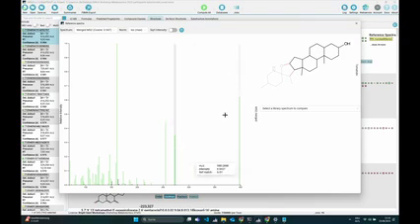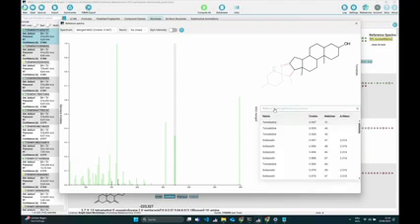But what I really wanted to show you here is that you can now select the library hit. If it worked for you and you could import the spectral library, the MassBank spectral library, you will now see a list of reference hits, and you will see the name of the compound from the spectrum in the first column, then the cosine score, the number of matching peaks, and also some delta mass, which I will show some example of very soon. Yeah, I still have enough time.